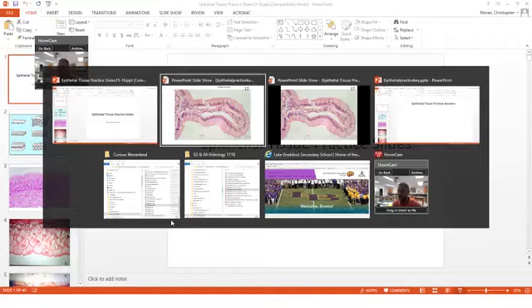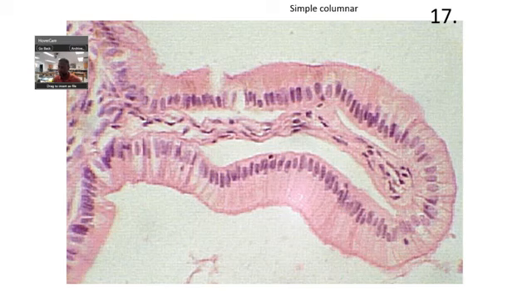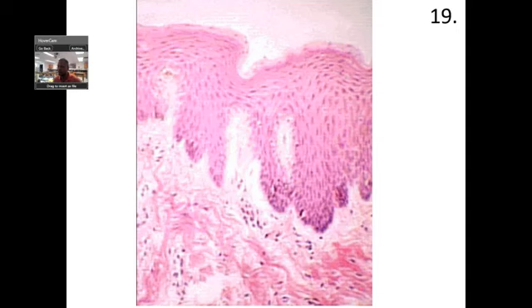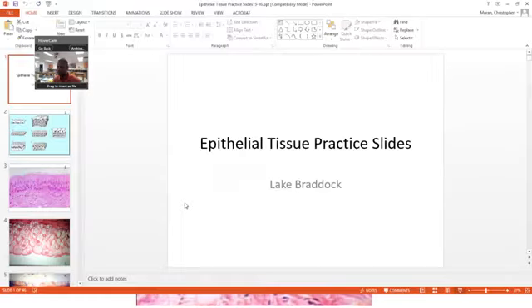I'm out of sync here. All right. So number 18, and that's going to be cuboidal. Right? Cuboidal. Stratified squamous again.